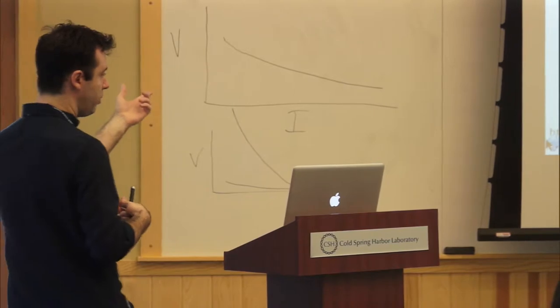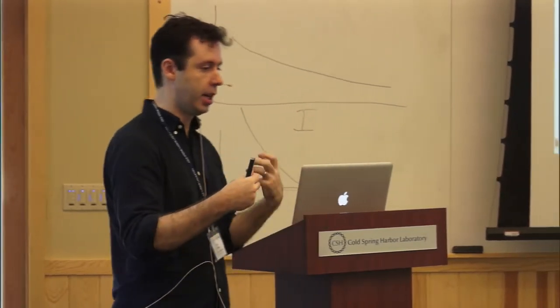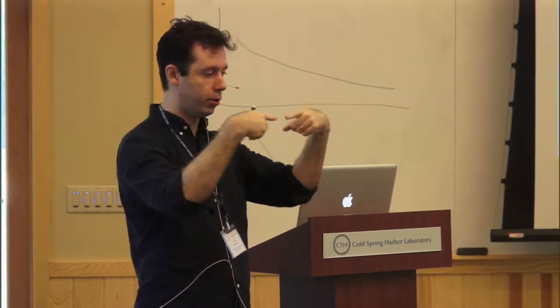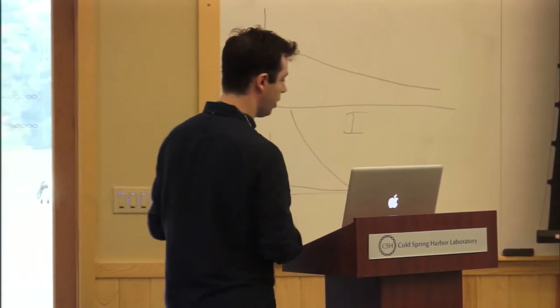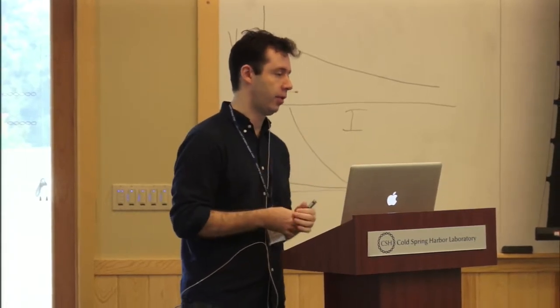We saw some pictures of ChIP-seq analysis. ChIP-seq is basically sequencing your pulled down DNA, mapping it to the genome. You look where you have a peak and that's it, you're done. The information about the two ends of the same fragment mapping to some location is not really helping you so much in terms of identifying the location of the binding sites. Okay. So it really depends on the application. That's really the bottom line.